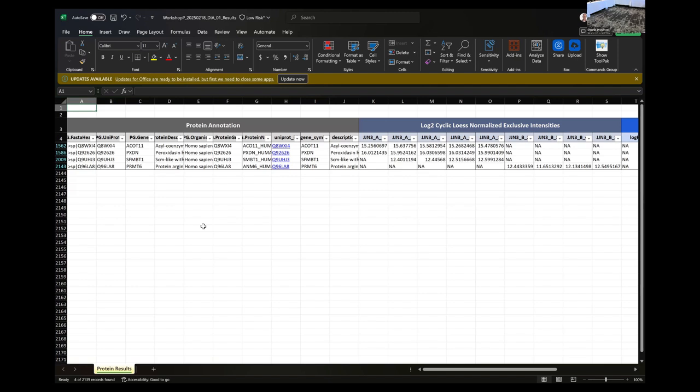Because by the time you get to this place where you're making your biological decisions, you want to feel confident that the data is firm and sound. We want to provide you with all of that, because you don't want to go chasing down a rabbit hole that really isn't there. Okay.